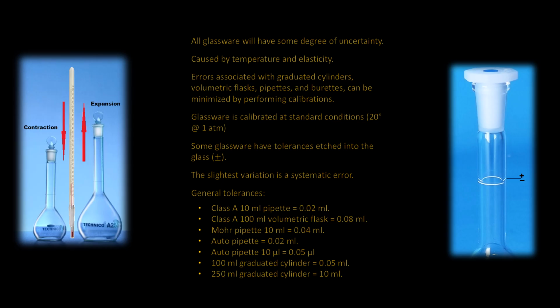These would be considered tolerable. If the calculated calibration volume is within these limits, the measured volume would be considered as being accurate. However, if more precise results are required, that is, greater than 95%, a calibration must be performed, and the calculated volume would be used.